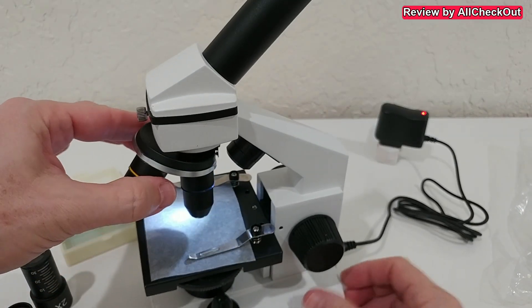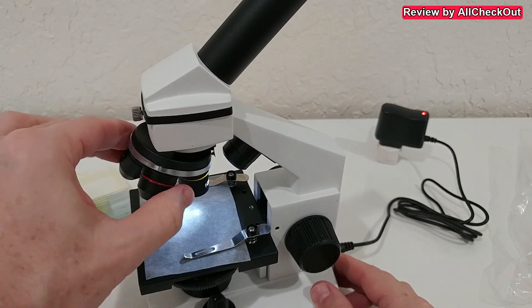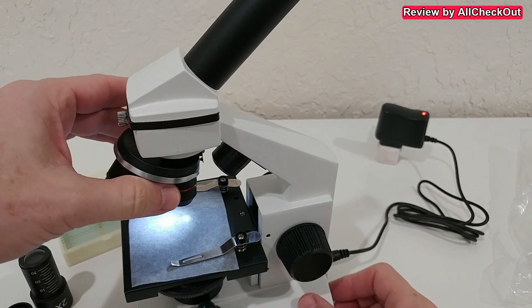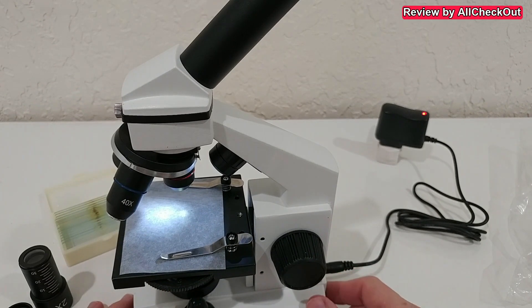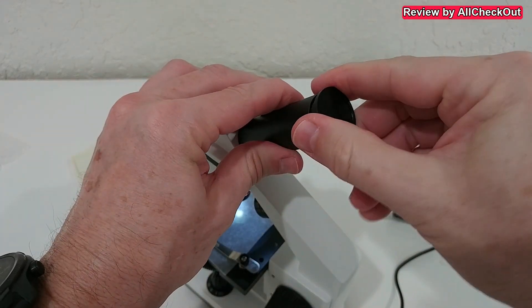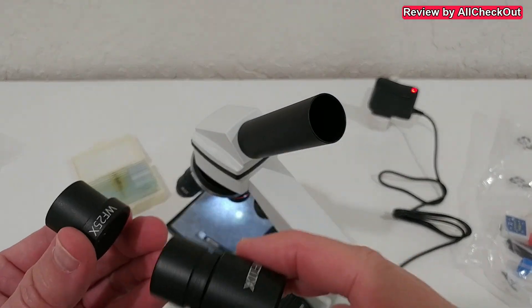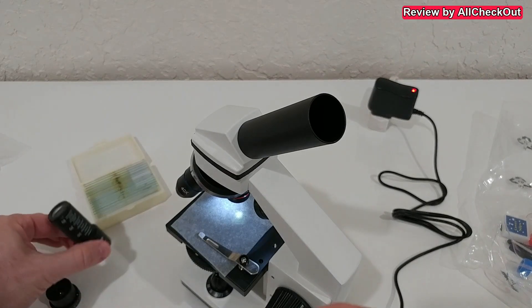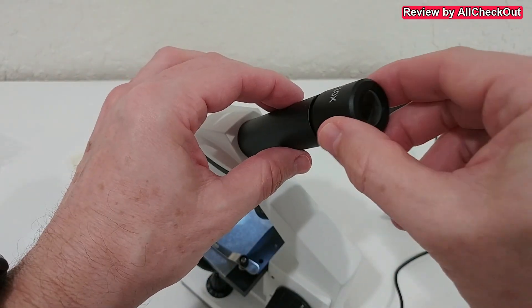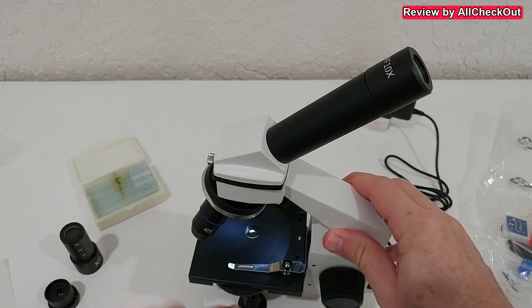Here we have the three different magnification objectives — the one that's active is always pointed down. We have the 40x, a 4x, and the 10x. It's usually recommended to start with low magnification and only increase if you want to see more. To really see something we have to remove the protection, then add one of the eyepiece magnifications: 25x, 2x, or 10x. Let's go with the 10x.